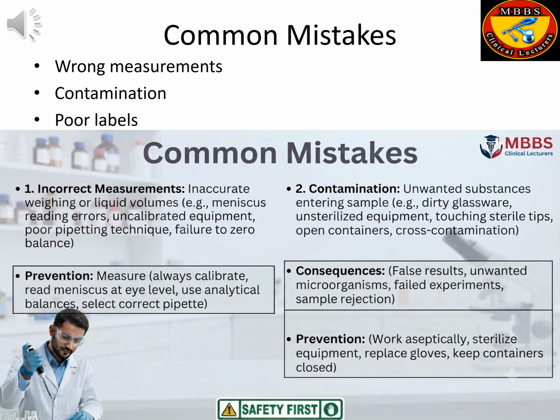Consequences: false laboratory results, growth of unwanted microorganisms, failed experiments, sample rejection. Prevention: work aseptically, sterilize equipment before use, replace gloves when contaminated, keep containers closed when not in use.